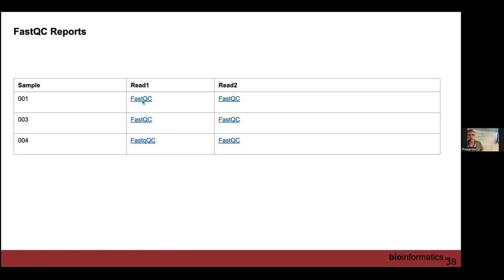Bernard mentioned that yesterday, that with short read sequencing, the longer you go, quality falls. That's why it's short reads, because you can't get quality calls after a certain length. We see a small drop over here. And there are other metrics looking at the quality across the tiles. It gives you an opportunity to see if there's something funky going on with your flow cell, whether some tiles aren't behaving very well. But generally that looks good. You don't see issues with it.